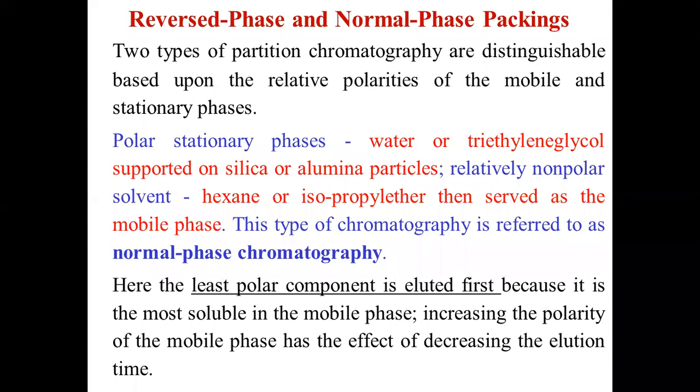So what we can do is separate two solutes by using a single mobile phase, and separate other four solutes by means of a second mobile phase, and you can separate some of the solutes which are left unseparated by means of another mobile phase. So you will be varying the composition of the mobile phase from one mobile phase to another, from one group of solvents to another group of solvents, and that is called gradient elution.